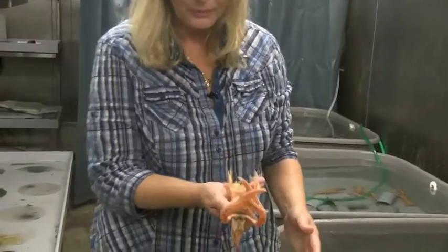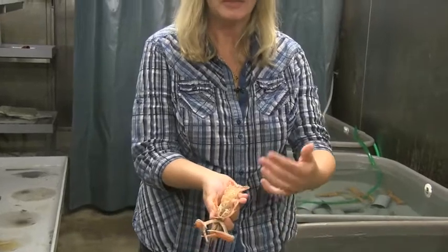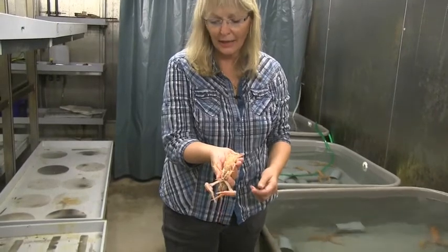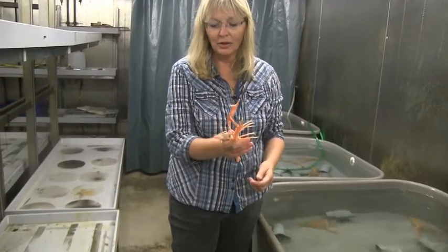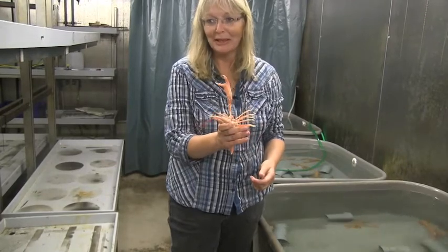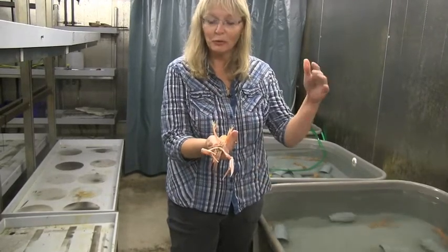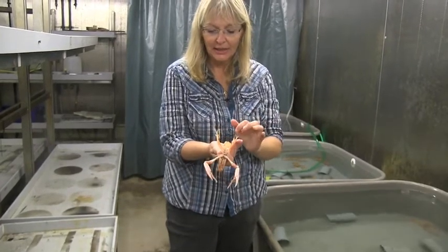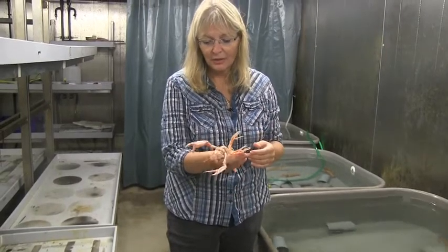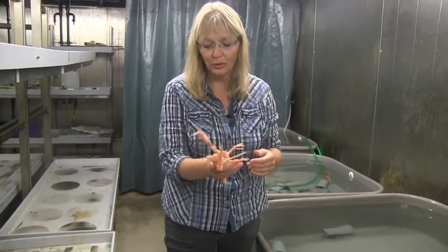When you hold them like that, it's like when they're in the burrow, so they press their tail towards your hand, and they are maybe not happy but they are content with being held this way, and they won't flail. And when you're handling females with eggs, you don't want them to flip their tail, because then they're going to lose a lot of the eggs. So this is the easiest way to hold them.